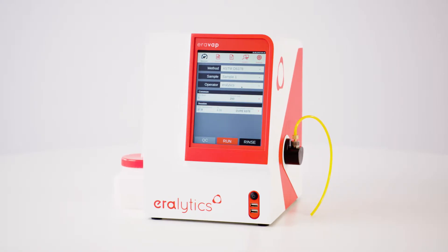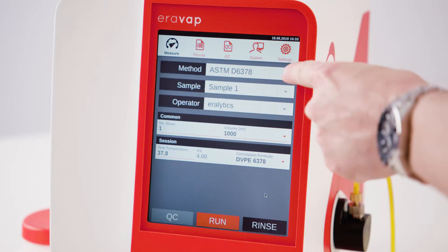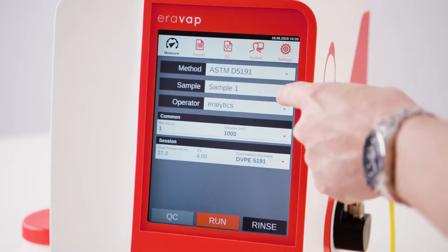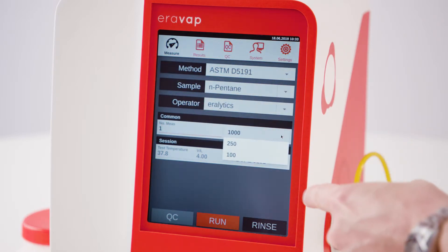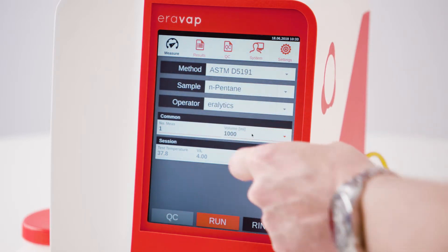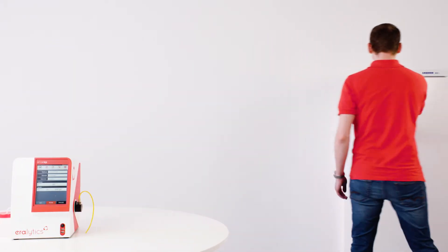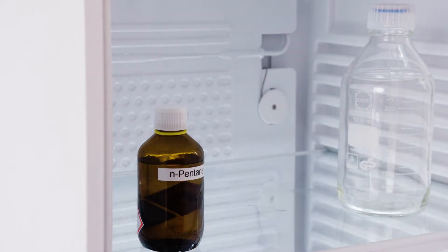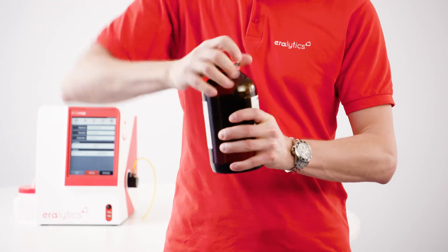Measurement. The intuitive user interface guides you through the measurement. Select a method from the dropdown list and enter a sample ID and operator. If required, adjust optional measurement parameters. Some methods, like ASTM D5191, may require sample preparation — prepare the sample according to the selected standard.